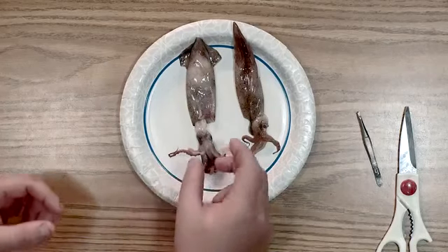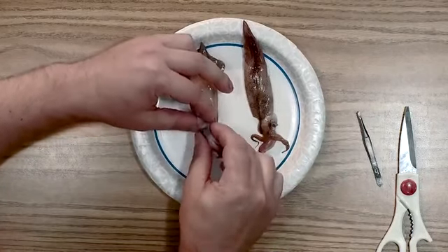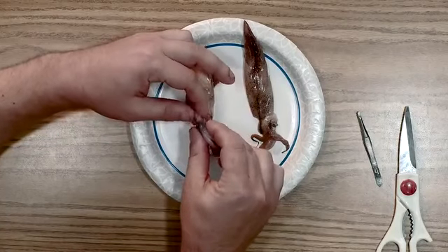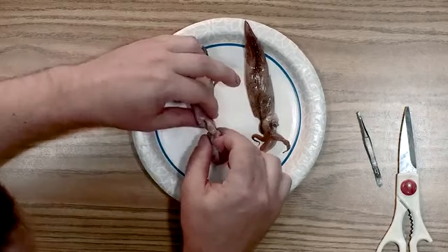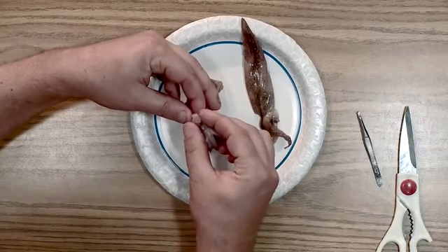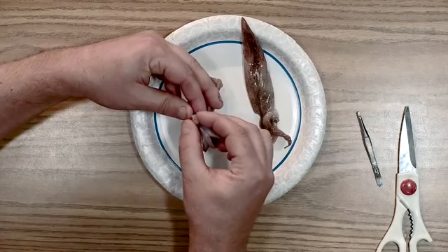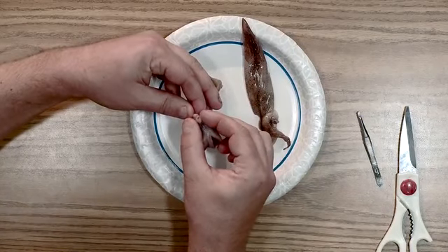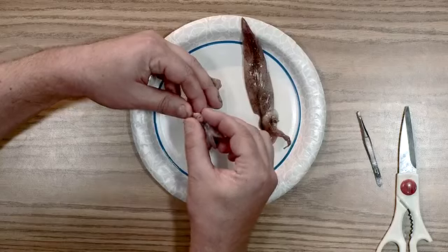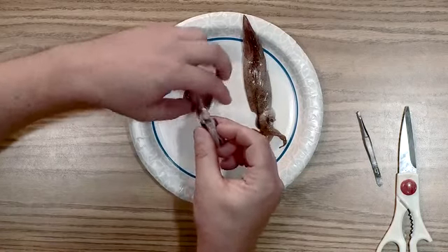And one of the things that open passageway allows is for this piece right here. And I'm going to try to open it up a little bit and see if we can see it. And if you see really close in between my fingers, you can see a little hole or a black looking spot open up. And what's going on here is there is a siphon that this squid has.